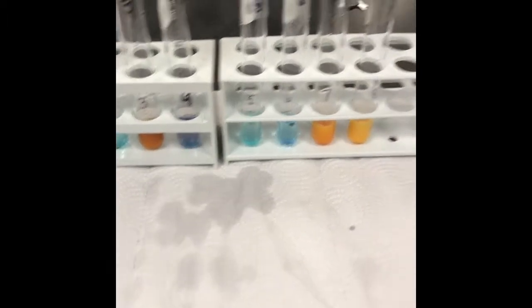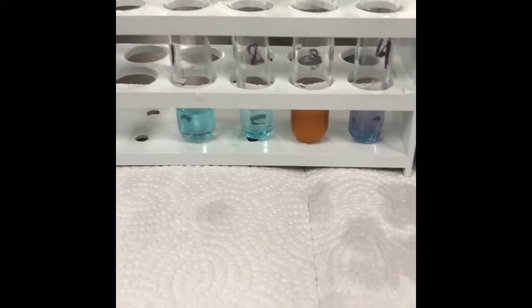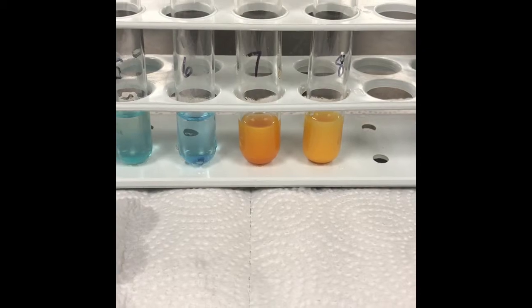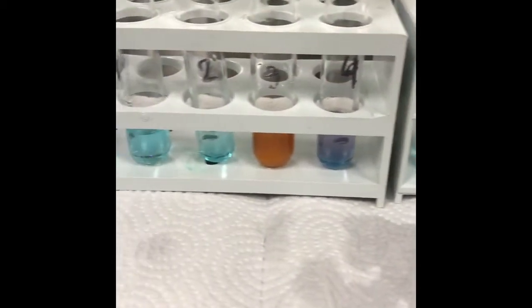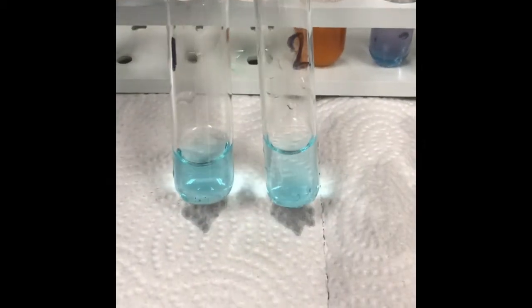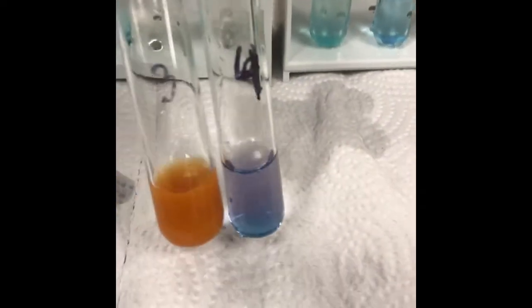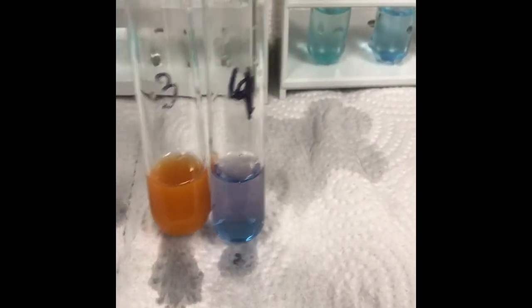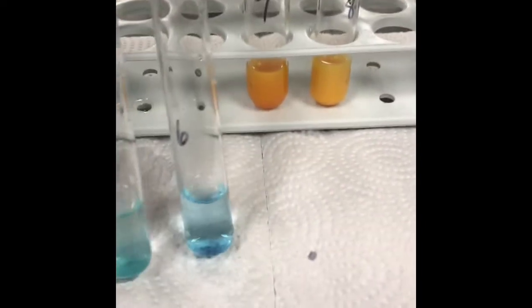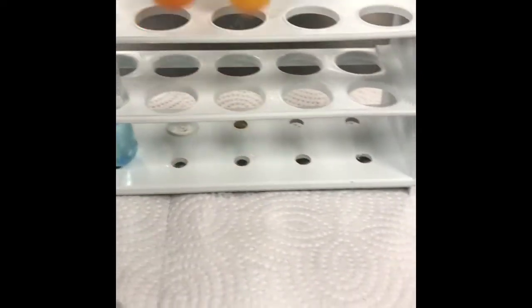Okay, I just pulled the tubes out of the hot water bath. These look amazing. These are tubes 1, 2, 3, and 4, 5, 6, 7, and 8. You'll probably want to pause the video and note the colors. I will pull them out so that you can see them a little bit clearer. That's 1 and 2. Like I said, push pause so you can see. That's 3 and 4. I'll put the oranges next to each other so that you can see the difference. That's 5 and 6. And then this is 7 and 8.